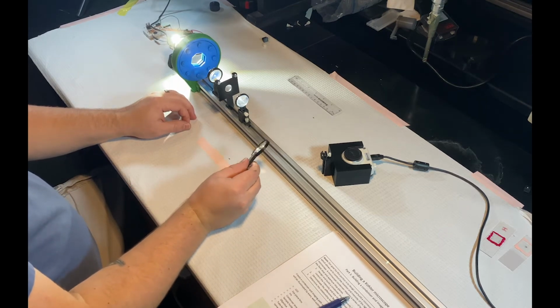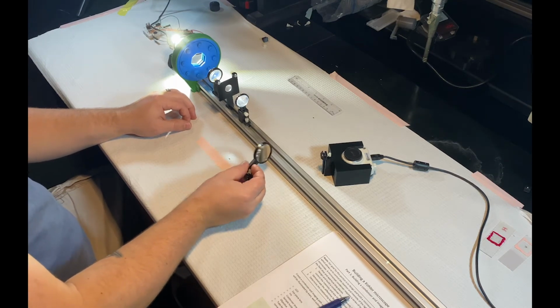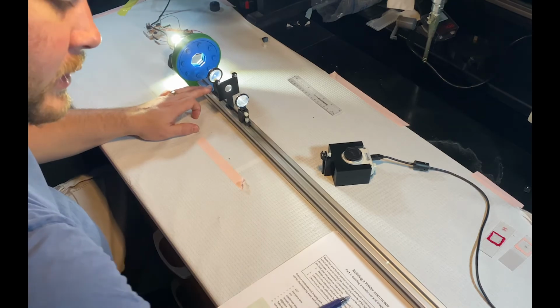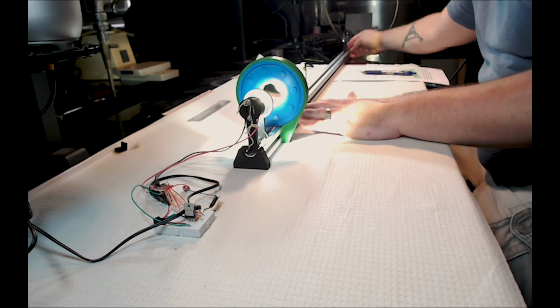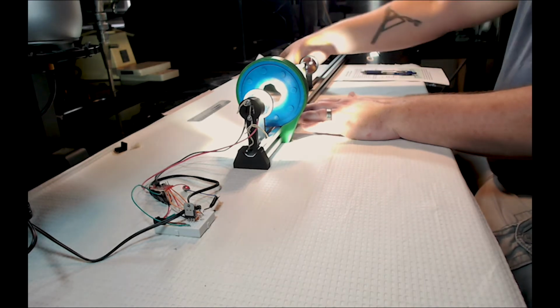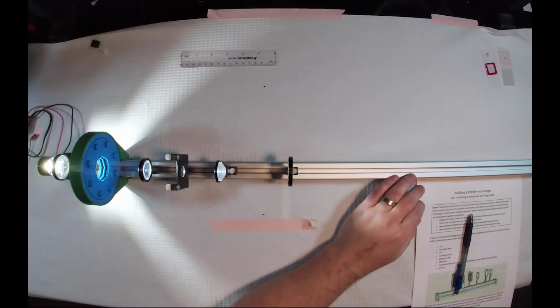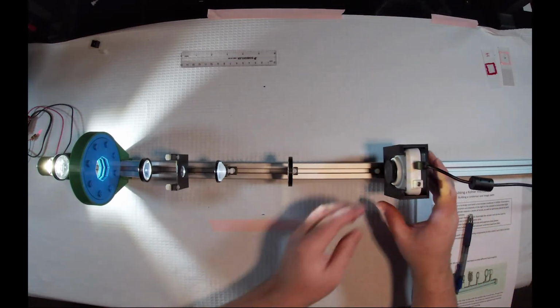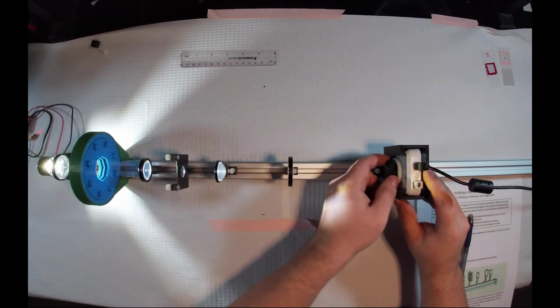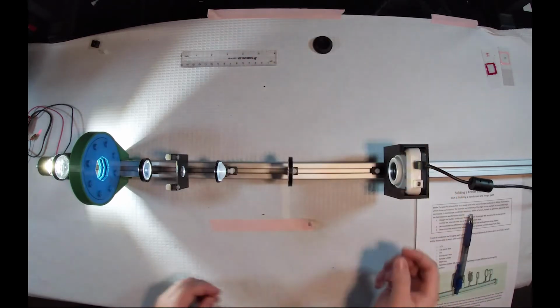Next, we have our tube lens, which we actually calibrated the magnification on last time in conjunction with this objective lens. So we will be sliding that on. And then finally, we have our camera. I'm going to go ahead and uncap my camera. There shouldn't be anything in there in the plane, but hopefully there will be soon.